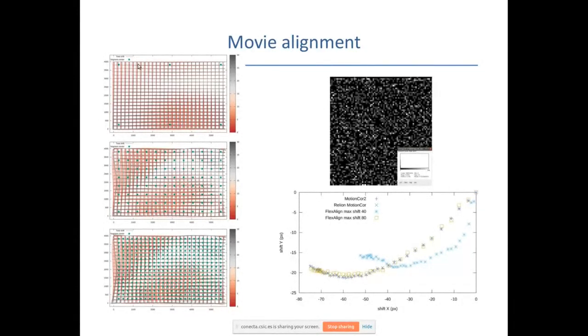If you use too few, you are not going far from the global shift alignment. If you use too many, you probably have distortions, especially at the border. The borders are very ill-defined because they are less constrained in most optimization problems. So using something somewhere in the middle is the right thing.